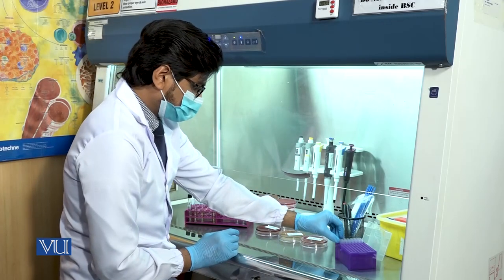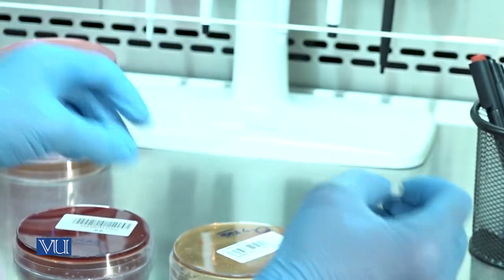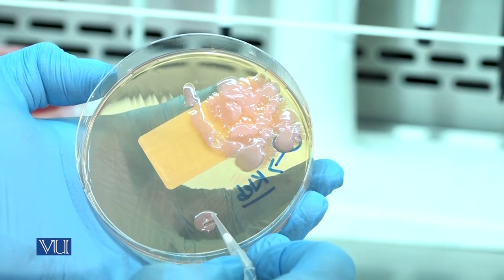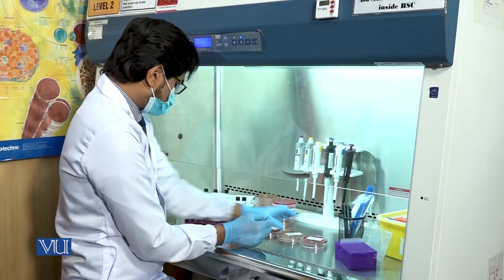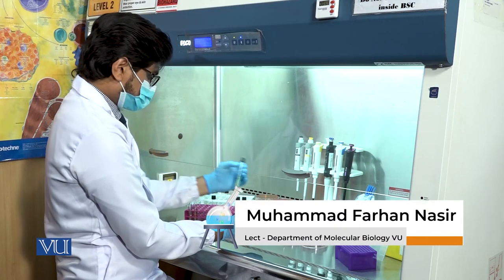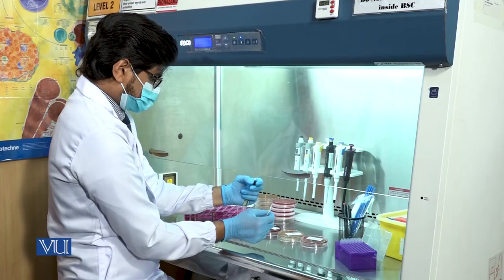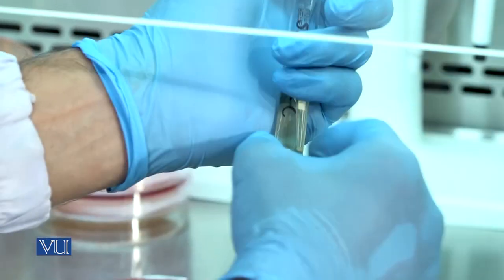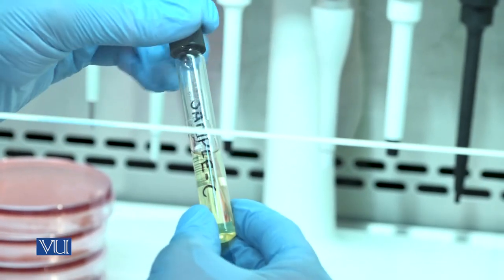Using a sterile pipette tip or toothpick, select a single colony grown on solid culture media. Drop the tip or toothpick into the liquid culture media. Loosely close the cap of the glass tube so that it is not airtight.